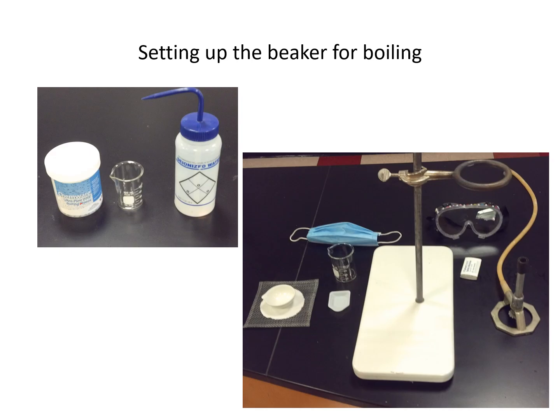You just need to make sure it doesn't superheat. You're going to fill it up to about 75 to 80 milliliters of DI water. Put that up here on the grill. Then this goes on top of your beaker, somewhat like a double boiler.